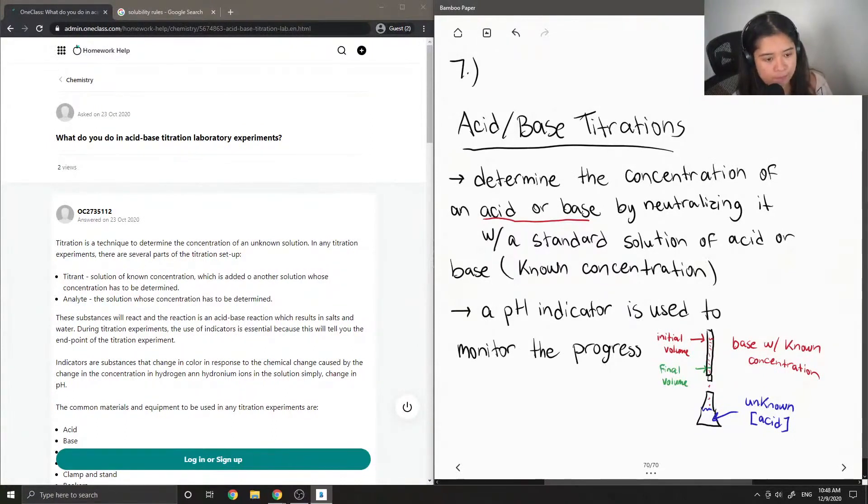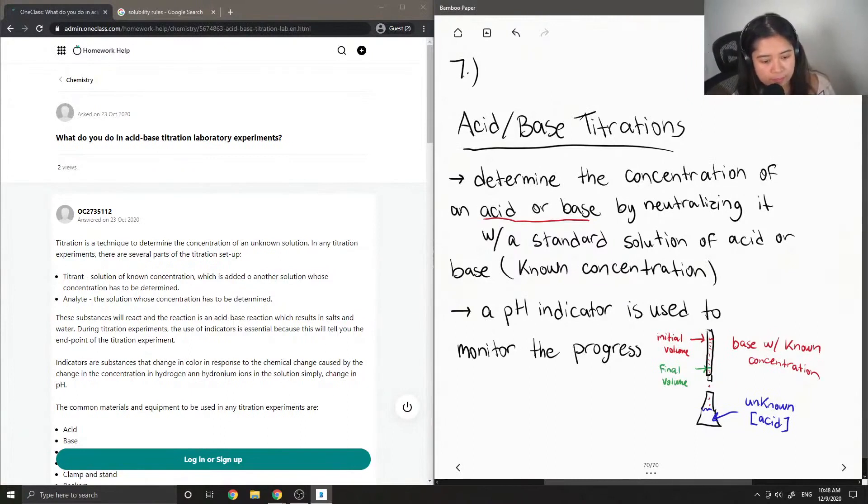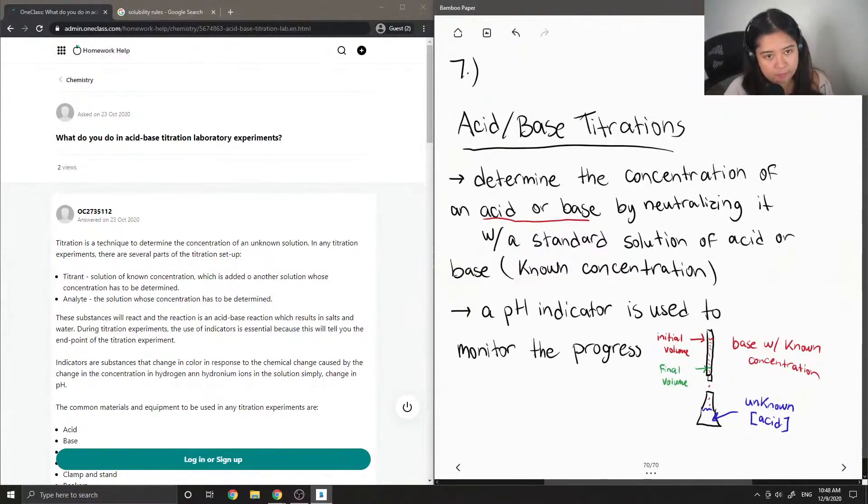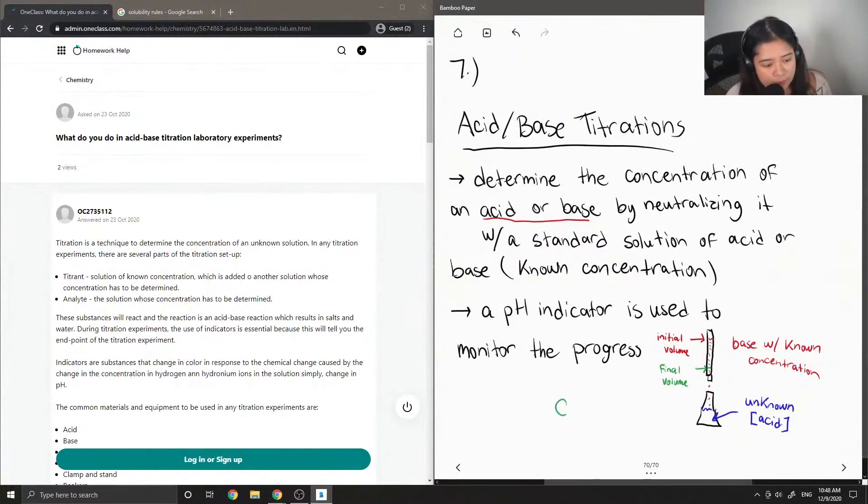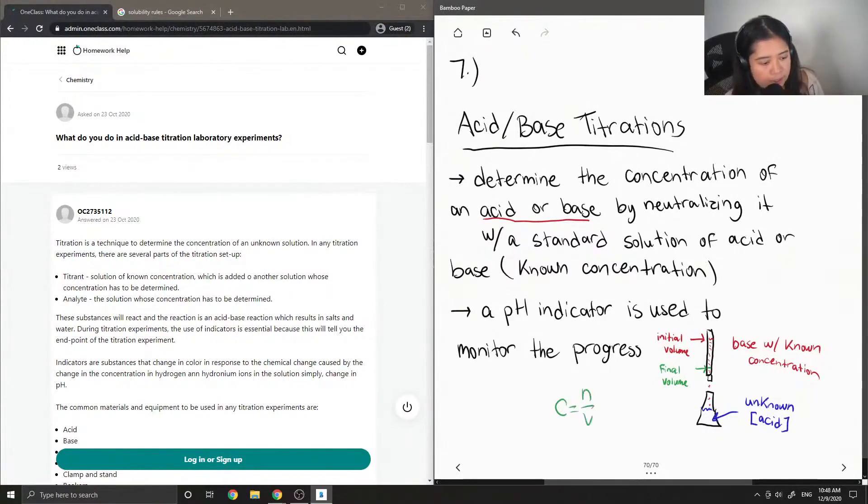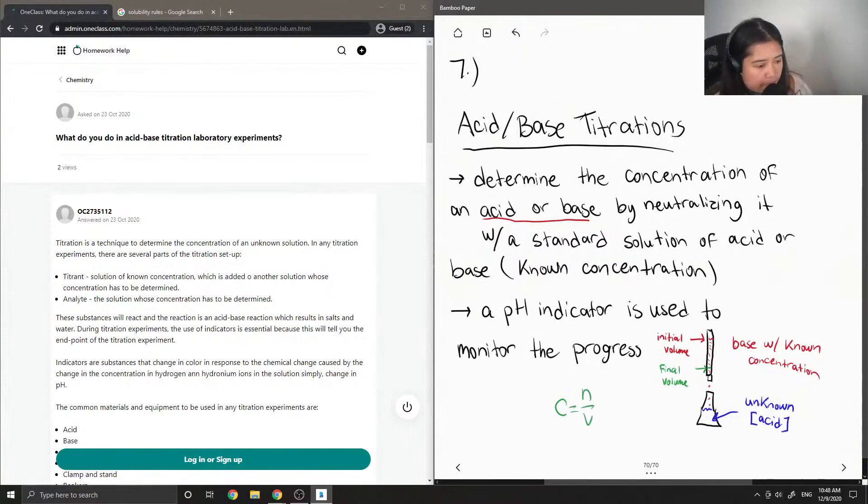From there, we can calculate the concentration of our unknown by using concentration equals number of moles over volume.